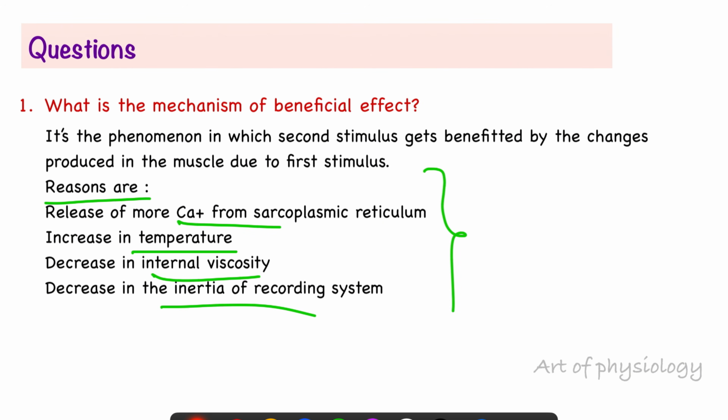So the second response takes up all these benefits, increasing the force of contraction. That is called beneficial effect.